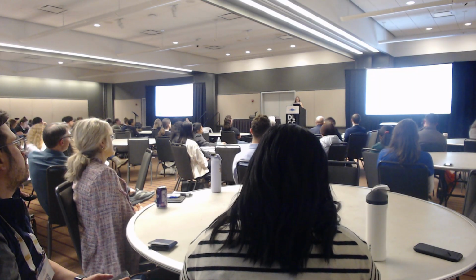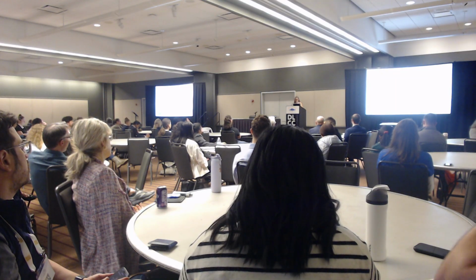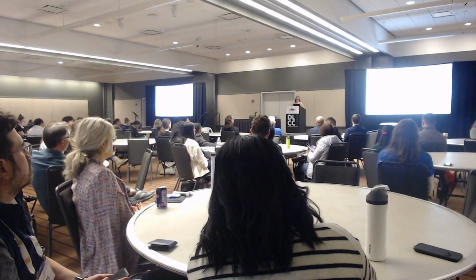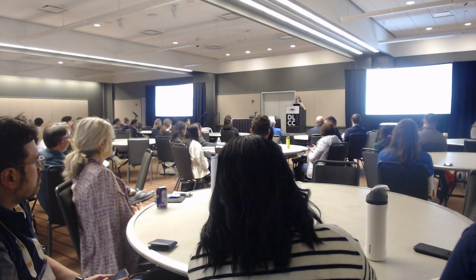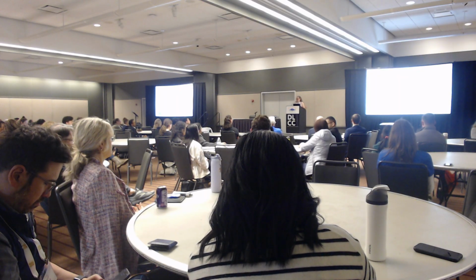I like to not just take the samples that companies have said, like GM12878 or whatever, like, oh yeah, that works great. I like testing with real live core samples. So she said, great. I said, you'll see the data and we'll talk about whatever. Of course, because we had done 5-hmeDIP at the time, it needed 1 microgram of DNA to do the immunoprecipitation, even in a cancer setting. So not all 18 samples had DNA left. And I had a small version of the kit anyway.